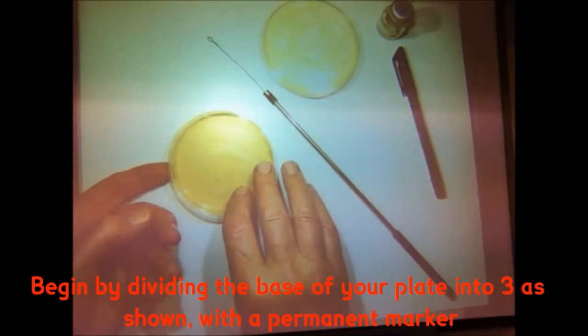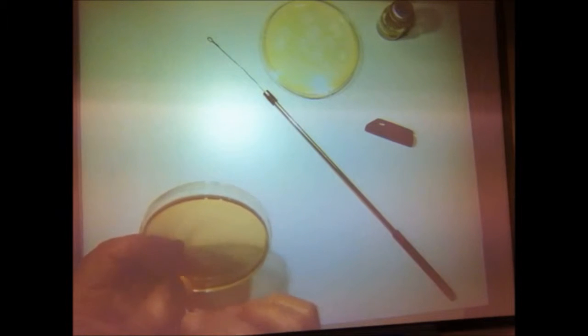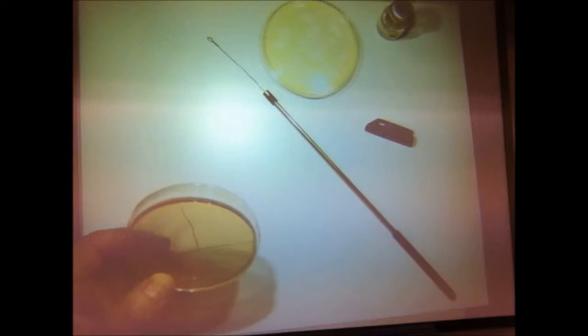I've got a sterile wire loop here and a plate of plain agar, and I'm going to streak plate Micrococcus luteus onto that. There are several ways you can do this. One of the best ways when you're first starting off is to turn the plate over and just draw a line across the center, like so, and then divide the top part off, like so, which gives you a guideline to actually start on.